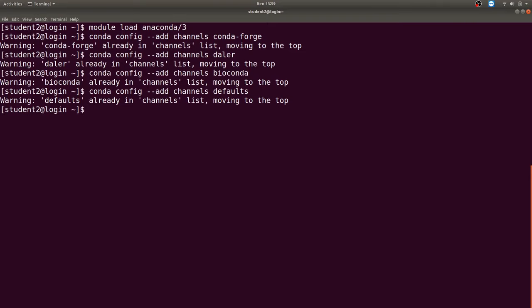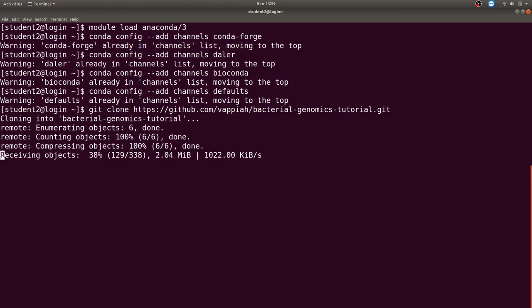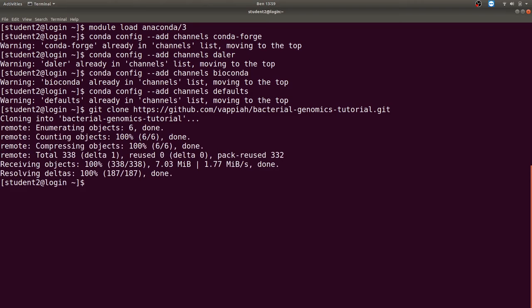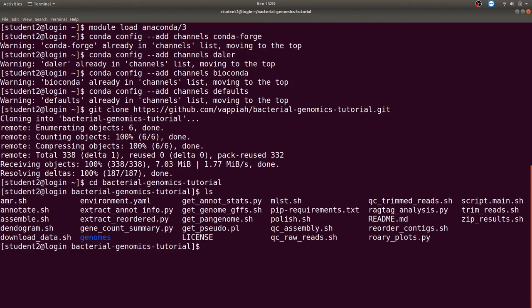Once you've added the channels, you're going to download the pipeline from GitHub. For that you need the git utility to clone the repository — this is where all the scripts I'm going to use are found. The tools I'm going to use have been set up and how you call them are placed in the scripts I'm going to run. You can feel free to open the individual scripts and find out what parameters are used. The cloned directory is called 'bacteria genomics tutorial' and in that directory you have all the scripts.